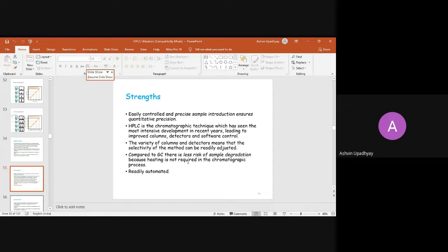And HPLC is quite ahead of GC technology. GC is gas chromatography, where you can degrade your sample and detect it in ionization forms or other forms. The limitations of GC are different from HPLC, because in GC, once the sample is degradable or volatile, then you can easily analyze it by GC. But in HPLC there are no restrictions of this type. Yes, there is a restriction that every analyte must have a chromophore. Chromophore is the only entity which is readily analyzed by HPLC systems.